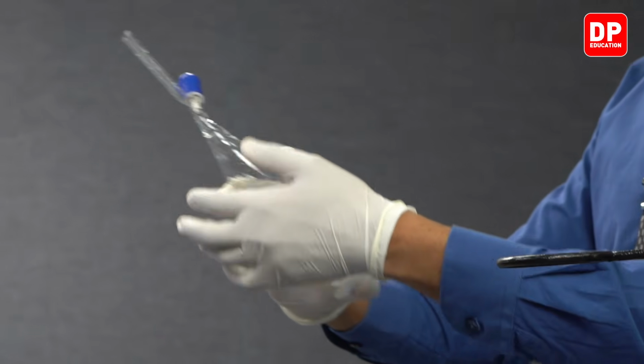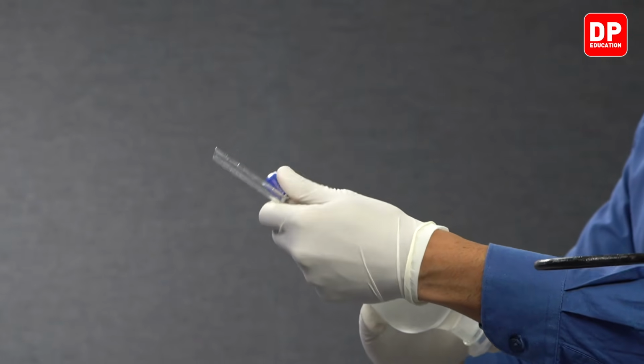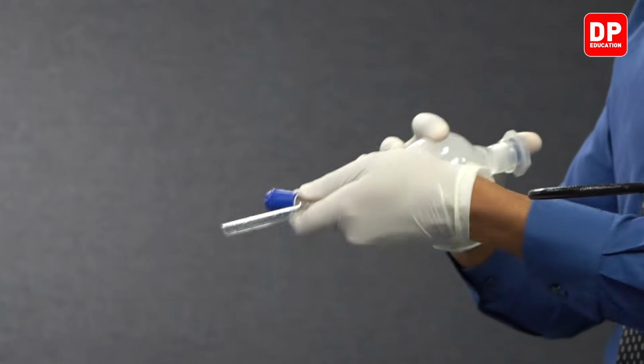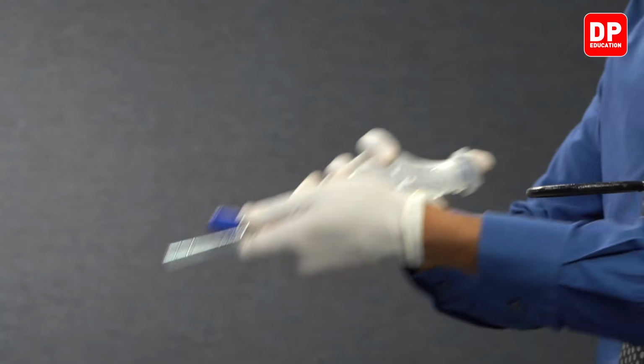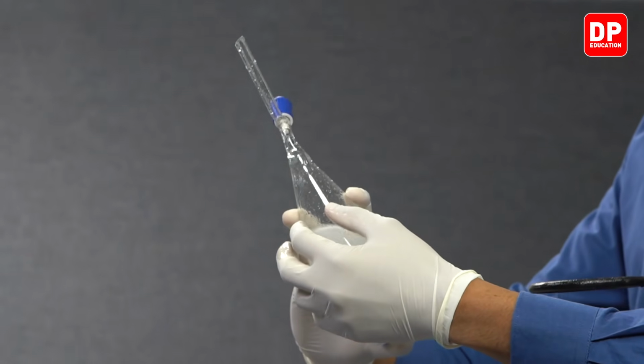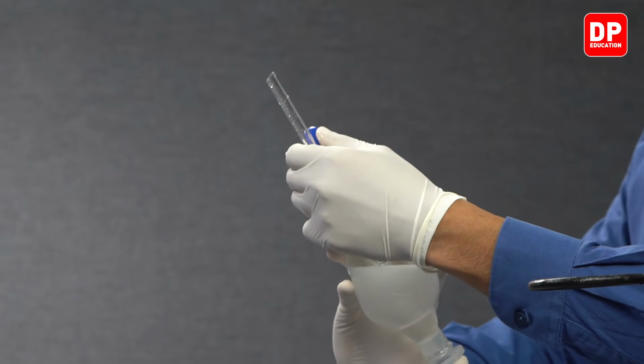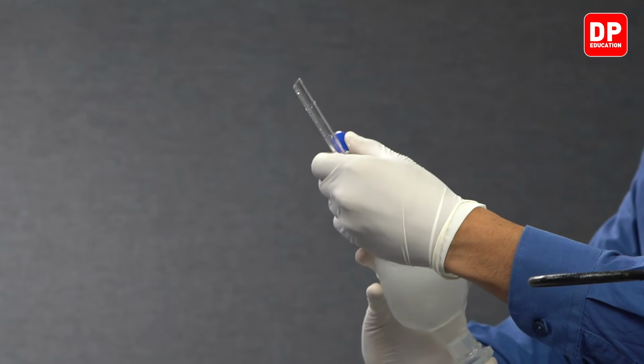and we can turn the stopcock to relieve the pressure like I have taught earlier. We can mix it really well, and then we can turn the stopcock to release the pressure like we have done in the previous two instances. We will repeat this a couple of times.